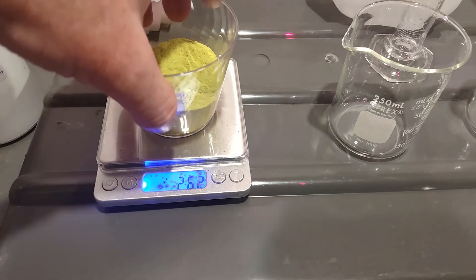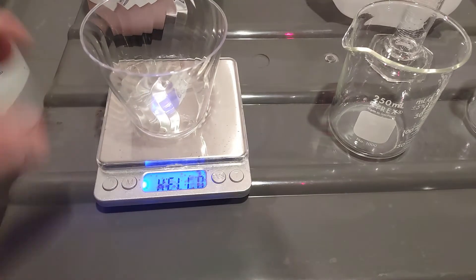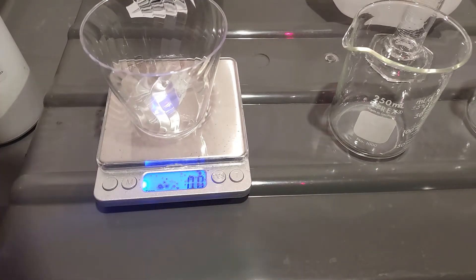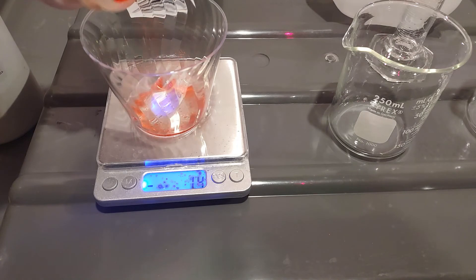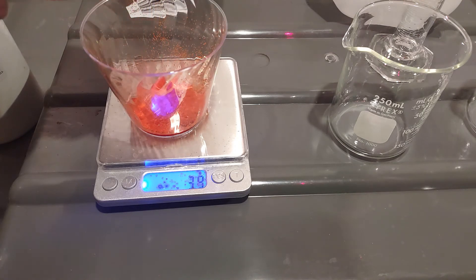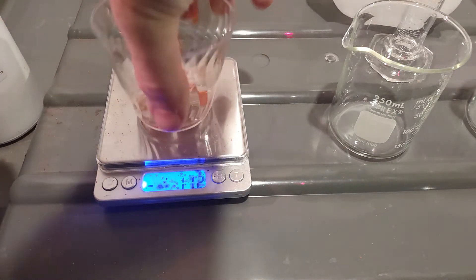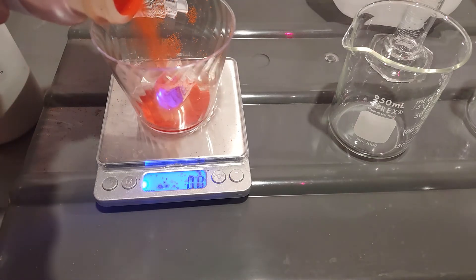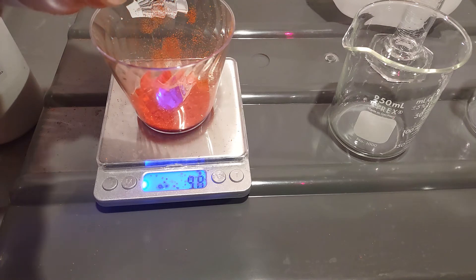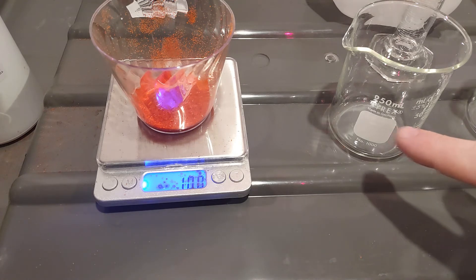Now I want to measure out the potassium ferricyanide — I need just 10 grams of this. This stuff tends to fly around so you've got to watch out. It's a lot heavier so it goes faster. I've got a problem — my scale isn't reading right, so let me pour it back and wash this off. All right, back to zero. There's 10 grams.